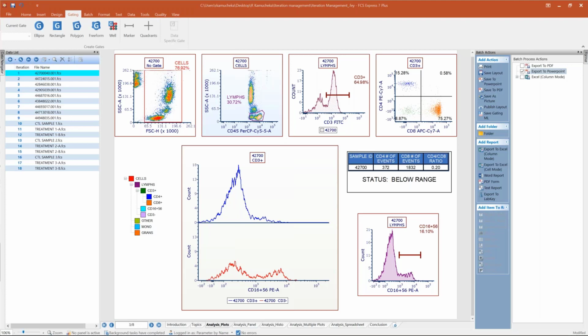For a panel, each iteration had 3 FCS files. How does it determine which FCS files belong to which iteration? Do the FCS files go in iteration 1, 2, 3, or can we manually dictate?